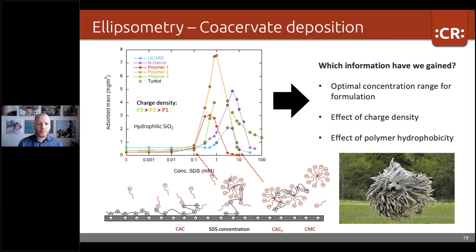and that will also shift this window where the deposition happens. And the client then used this data for benchmarking, comparing with competitors on the market, like marketing material, but also to tell their clients whereabouts in this mixing ratio they should try to make their formulations.